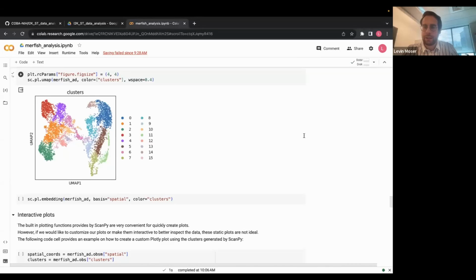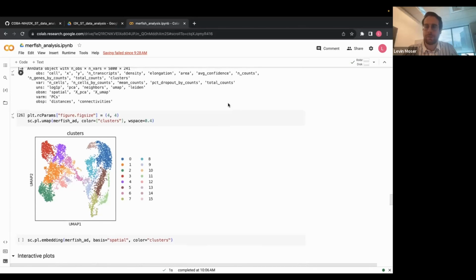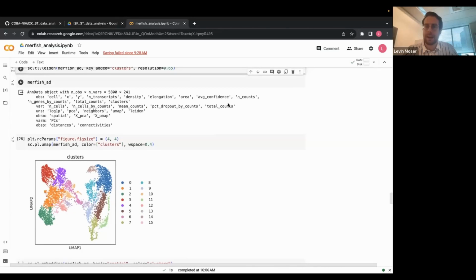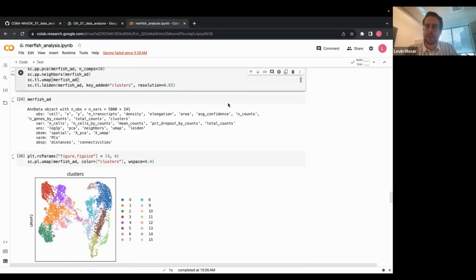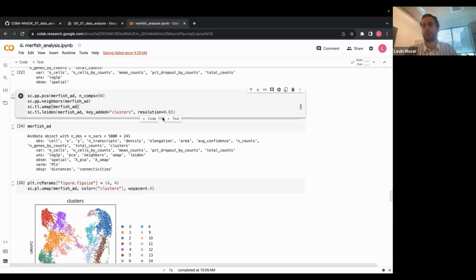No, I don't really have any tips or suggestions to choose the parameters in Leiden, unfortunately. That again kind of depends on the data. And with these clusterings, to some extent, this is what's nice about PCA, principal component analysis. It's not used that much anymore. It was sort of replaced by UMAP and t-SNE.